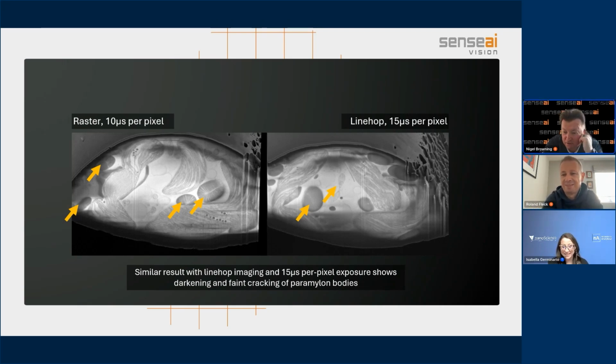Yeah, so I'll just say the same thing. Basically, you can use it for imaging in any way that you want to do it, and any way you choose to bring the sample out. For the examples that Roland is showing here, it is just blasting away one layer and going to the next layer. But if you wanted to cut that layer out and then get a reasonably high resolution image from the SEM before using that for cryo-ET, then you can do it.